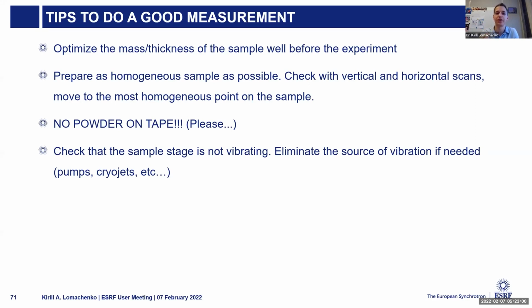So we were very surprised when we actually saw it, because you would say that it's not much, the air does not absorb much. But in EXAFS, you are sensitive to changes down to 10 to the minus 4 of the X-ray absorption coefficient. And these changes can very well be introduced by this kind of effect.